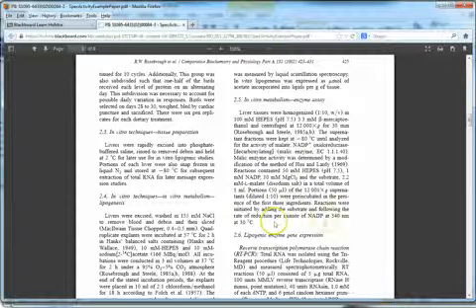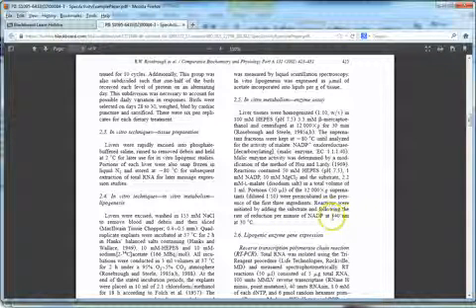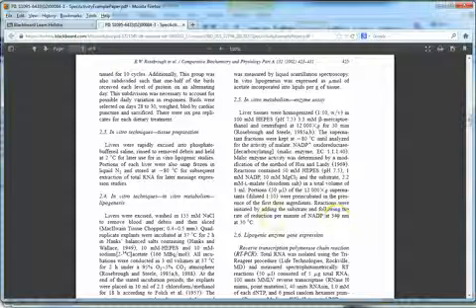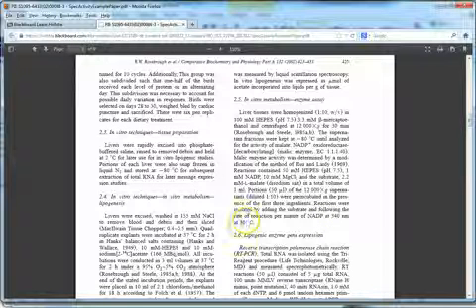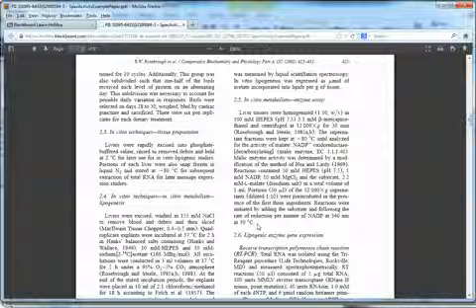Actually, they say they're following the rate of the reaction, so they did the reaction in a spectrophotometer, obviously, because they're following per minute, so they're measuring NADPH formation in the spectrophotometer, which is set at 30 degrees. So they have a little more complicated situation than we did.